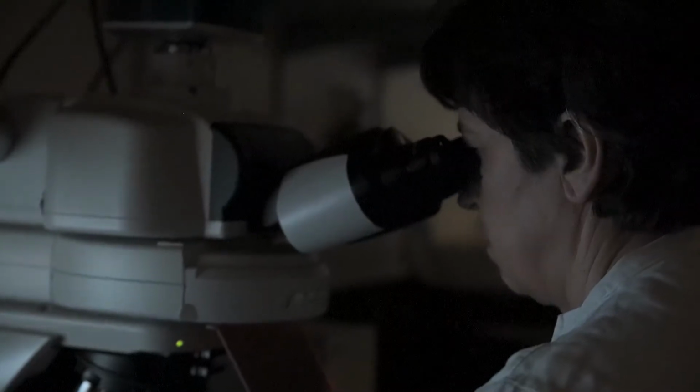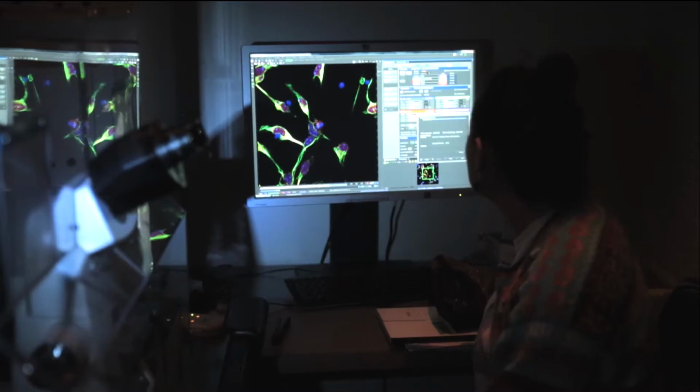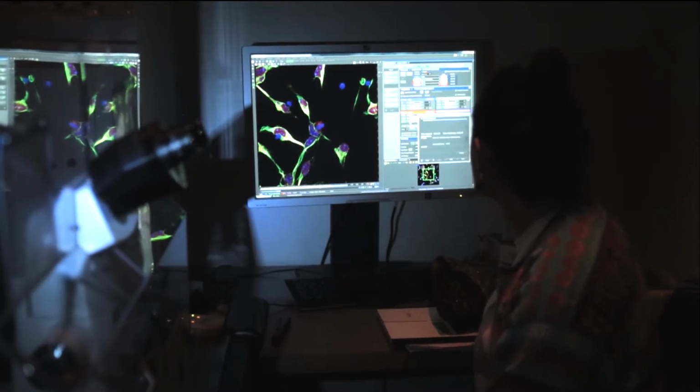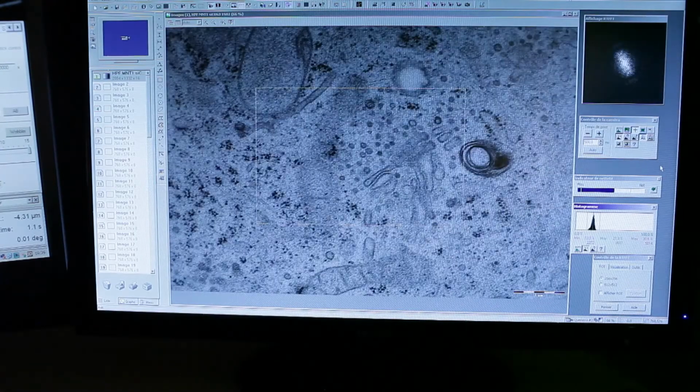To achieve that, we first need to have high-resolution light microscopy, and then being able to fix the sample to transfer it to the electron microscope. Light microscopy brings us specificity and dynamic information about what's happening in the cell. On the other hand, electron microscopy will give us ultrastructure information and contextual information at much higher resolution, but everything has to stay static. It's not dynamic anymore, it's fixed. And so the whole thing around correlative light and electron microscopy is to be able to go from light microscopy to electron microscopy without killing the sample or disturbing it too much so that we do not retrieve it well.